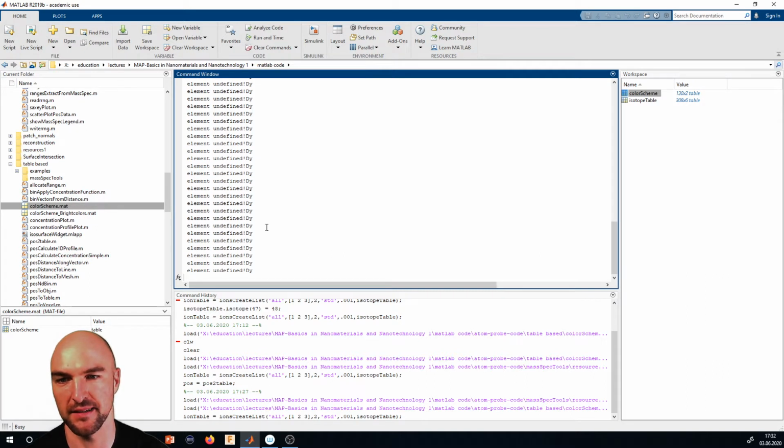Yeah, this is the bug. For some reason, it has a problem with dysprosium. So if you're working on dysprosium, which we are currently, by the way, then this will show up, but it's not actually a problem. I don't know why it plots it out. Anyway, we'll have that fixed.